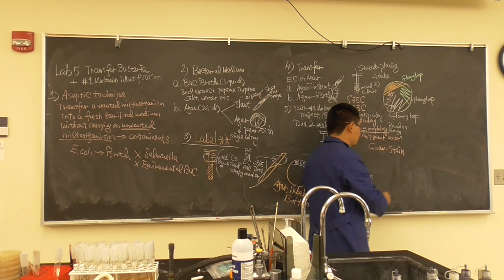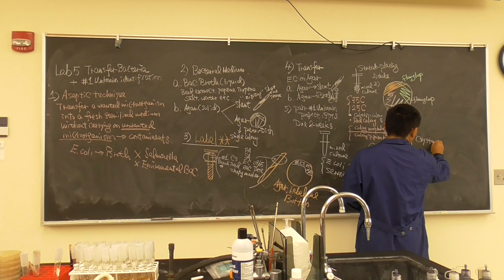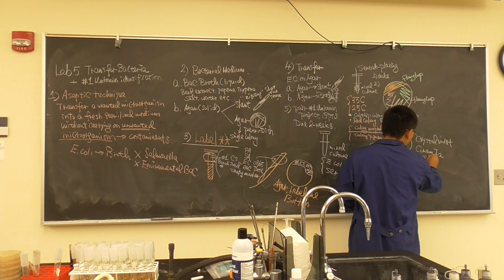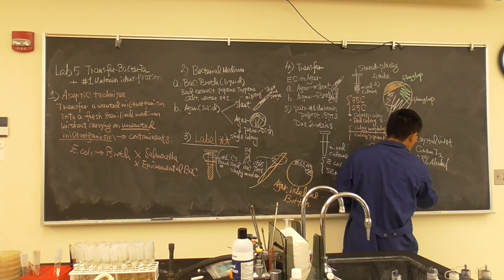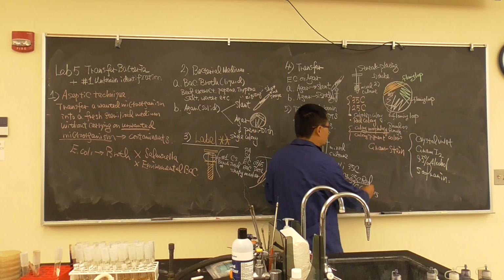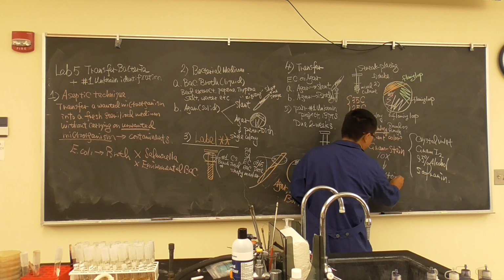Now the gram stain procedure, you already know that. Is that right? Crystal violet, followed by gram iodine, 95% alcohol decolorization, and counterstain with safranin. And you need to tell me the 3 pieces of information. So use 10x, find a specimen, transfer to 100x with oil immersion.